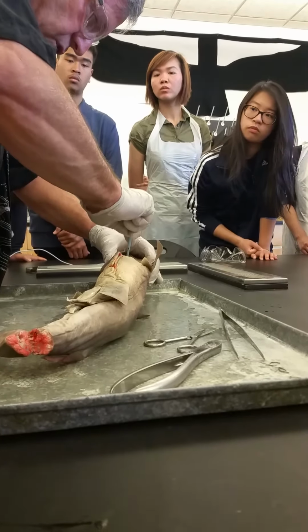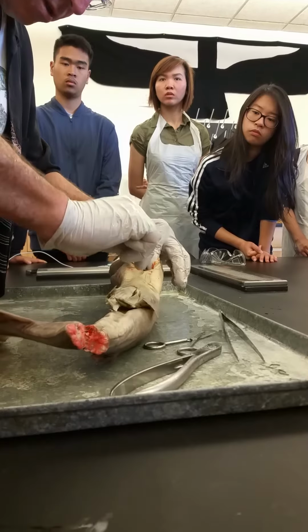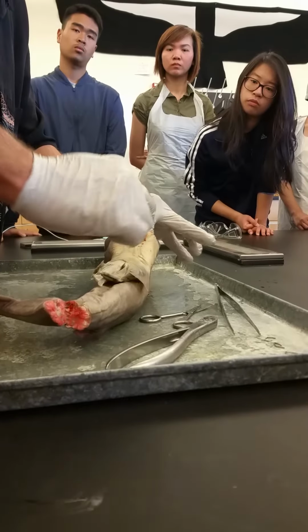When you do dissections, you only use a scalpel to get through the skin. After that, scissors are the better way to go. You're less likely to massacre everything. Of course, having a sharp scalpel is better than a dull one.